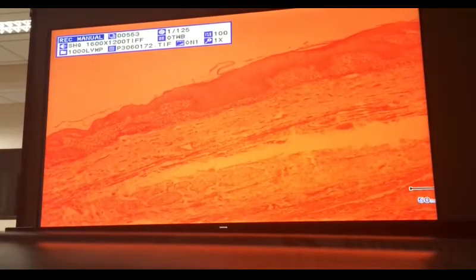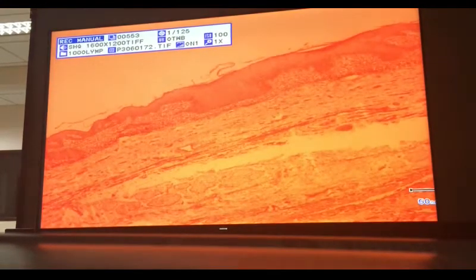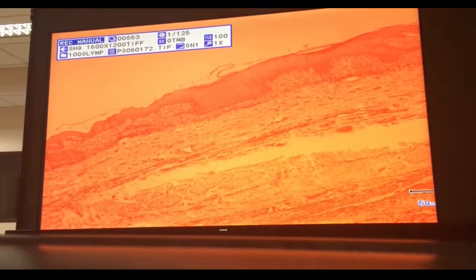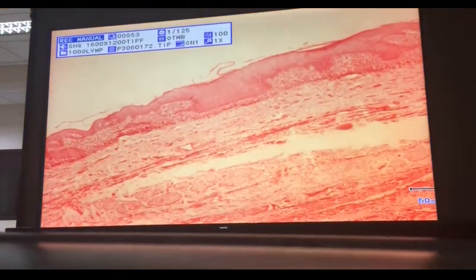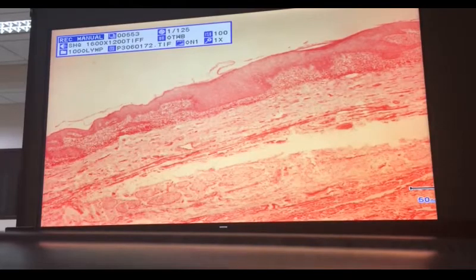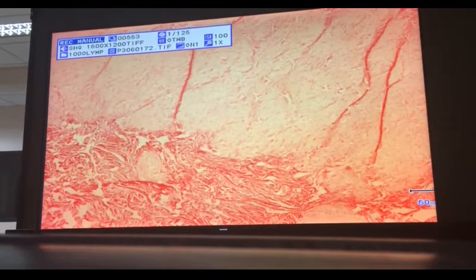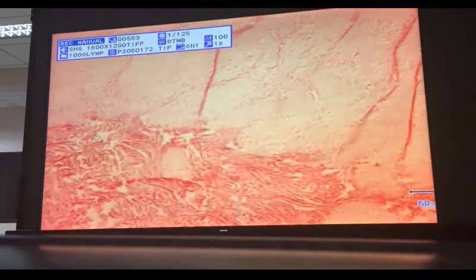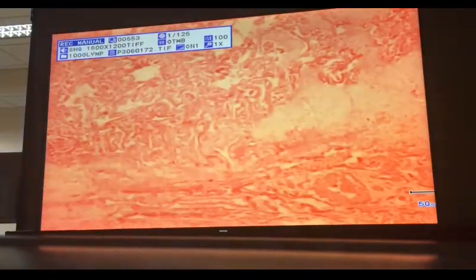And how do you call the connective tissue immediately underneath? Lamina propria. How about those smooth muscles immediately underneath the loose connective tissue? Muscularis. What is the specific name of that? That will be your assignment. And how about that connective tissue immediately surrounding the cavernous bodies? That also has a specific name. That will be your assignment. I forgot.